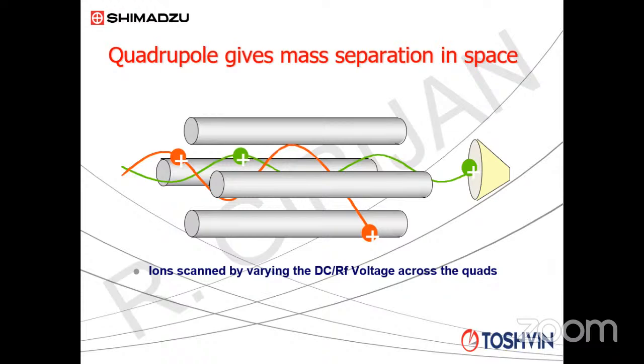And the whole process will be completed in maybe a microsecond or a millisecond. It's a very, very short period of time. That means we have successfully taken out all the ions from the ion source and sent them to the detector. Ion source is empty. Now the next compound will come from the column. That will also undergo ionization. The process gets repeated. So this is how we take them out.